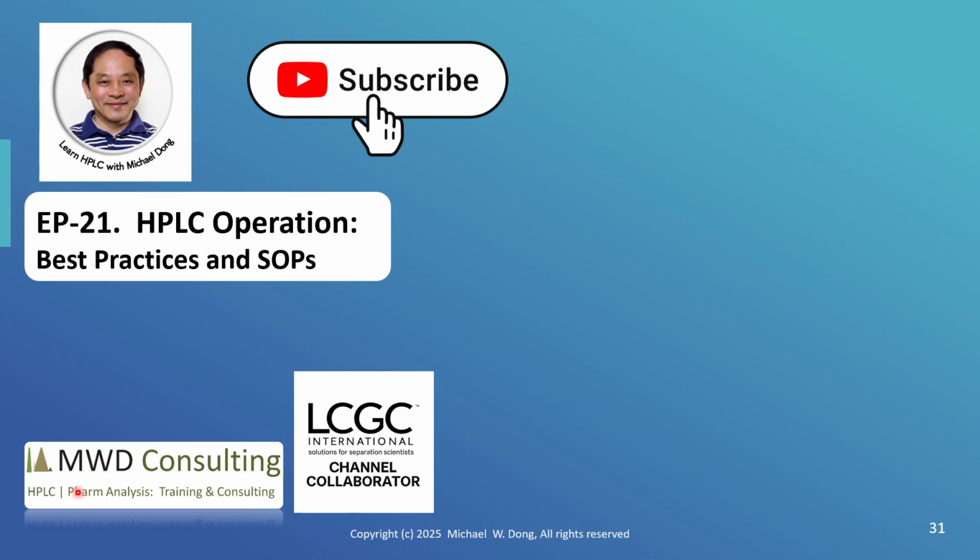Here's the end of the video, and we described episode 21, HPLC operation, some of the best practices and standard operating procedures for almost all the major modules. Also some of the strategies for qualitative and quantitative analysis, including how to increase precision for retention time and also for peak area.